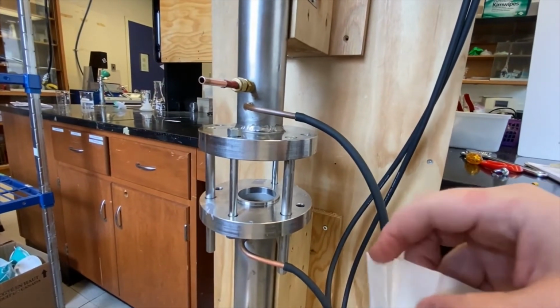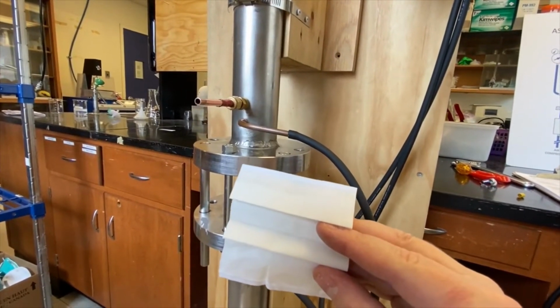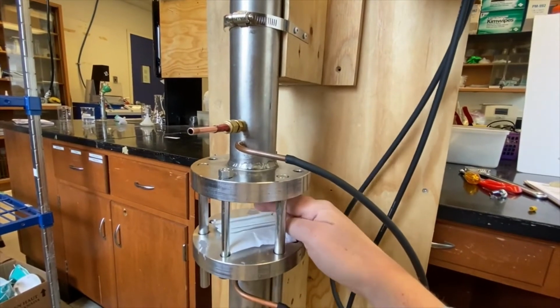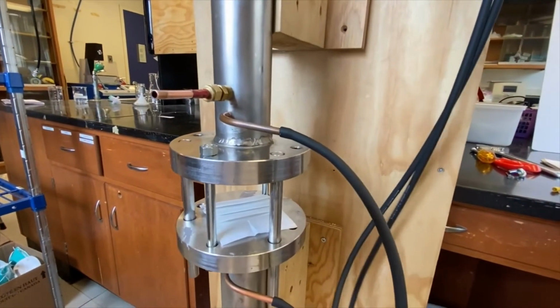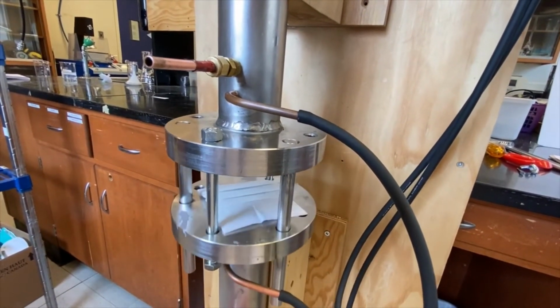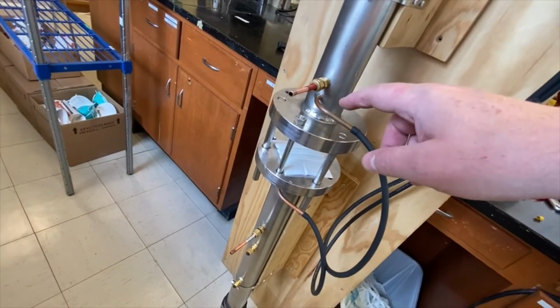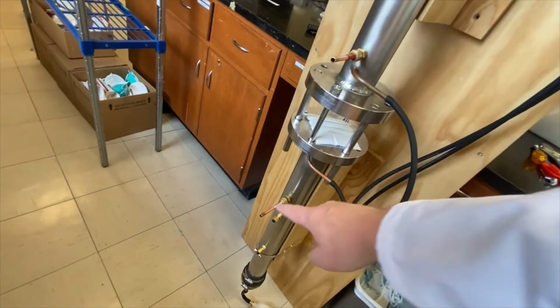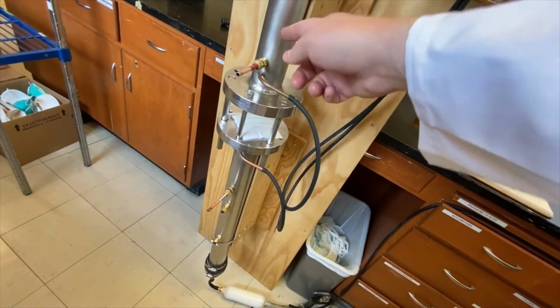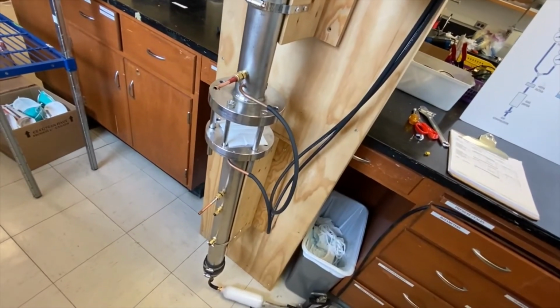And normally what we do is we snip a tiny piece out from the center of a mask. Remember, this is a device that's used for testing medical masks or also non-medical masks. And then we place that over top of the hole in the duct, and then the device moves in and we attach it and pin it together so that air doesn't leak out. And then the same idea. We have an air tap here and an air tap further down where we can take samples to measure the upstream and downstream concentration of those very fine particles as air moves through the mask.